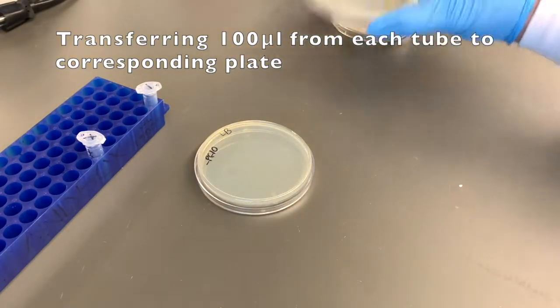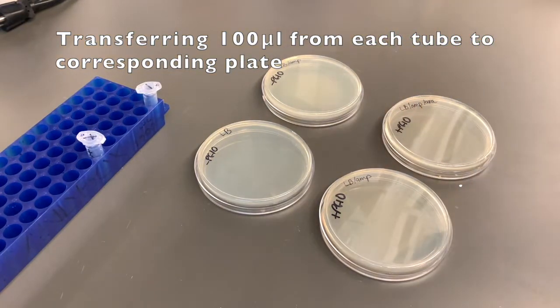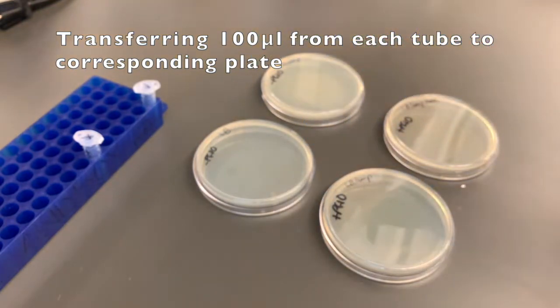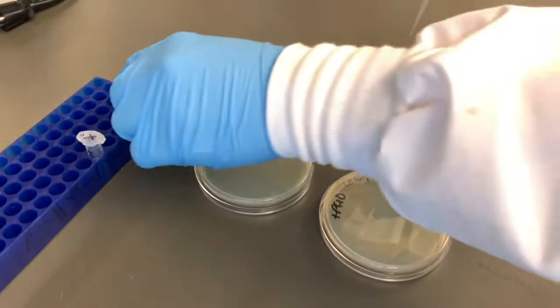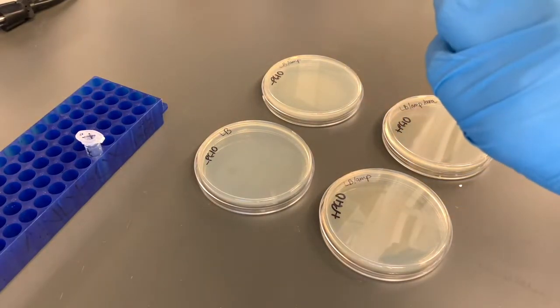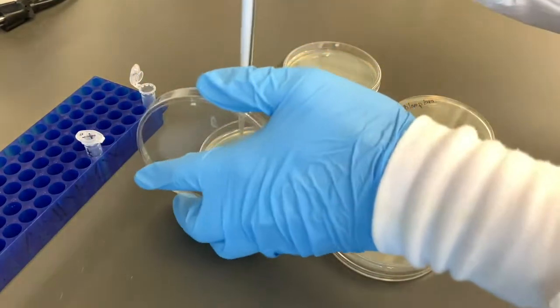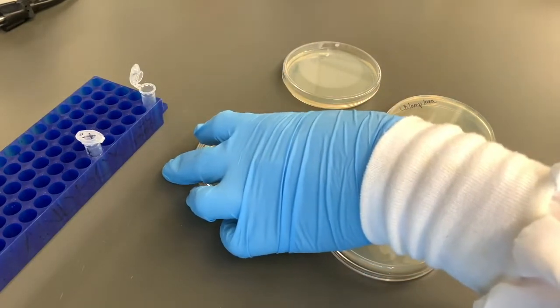Here again, we've skipped a few steps just to show you the most crucial ones. You want to be very careful that you plate the right solution from the right tube onto the right plate. In each case, use 100 microliters with the micropipettor and put that on each plate. You sample out 100 microliters from the tube and then spray it out on the top surface of the agar, the nutrient medium of the plate. It doesn't matter exactly how you spread it at first, because you're going to spread it more completely in a second.